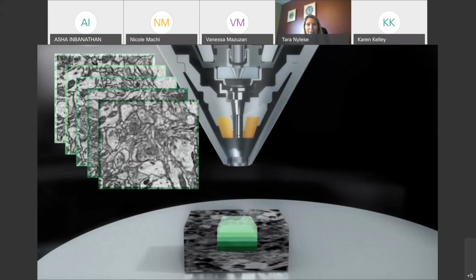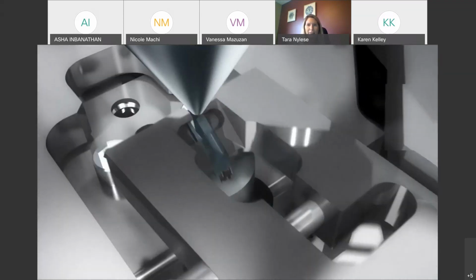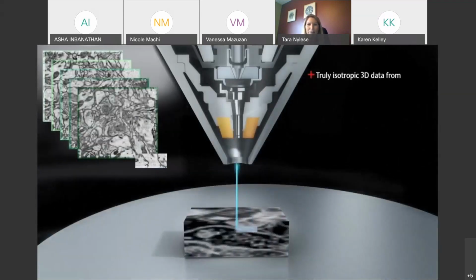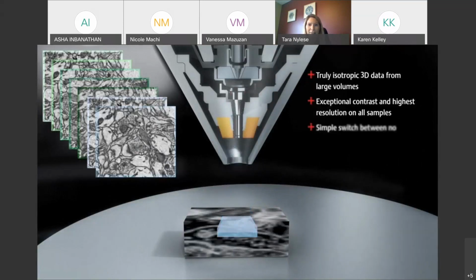And that allows us to get more sections of a smaller Z height without doing as many physical sections, which can be a challenge to do with very thin Z sections. 15, 20 nanometers is achievable, but you need just perfect sample prep. And then here's the sequence again.